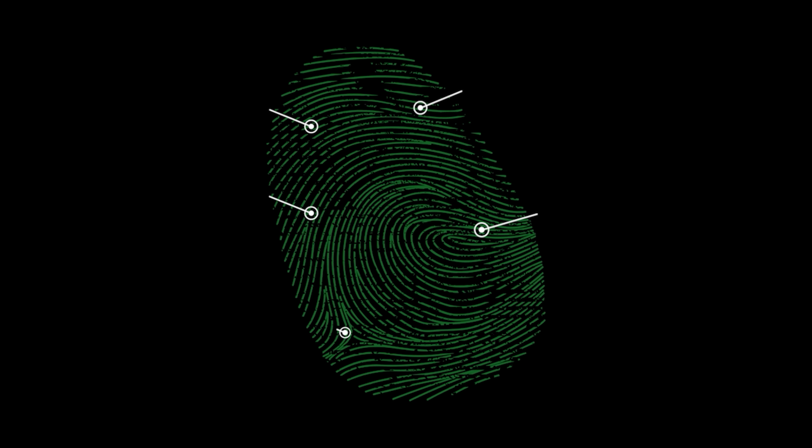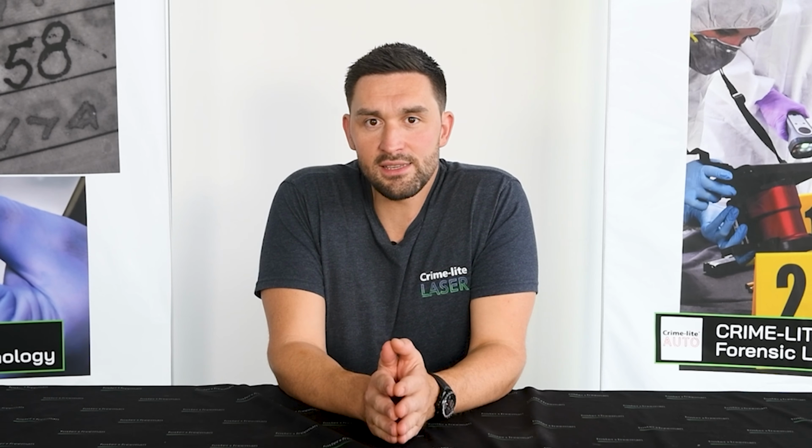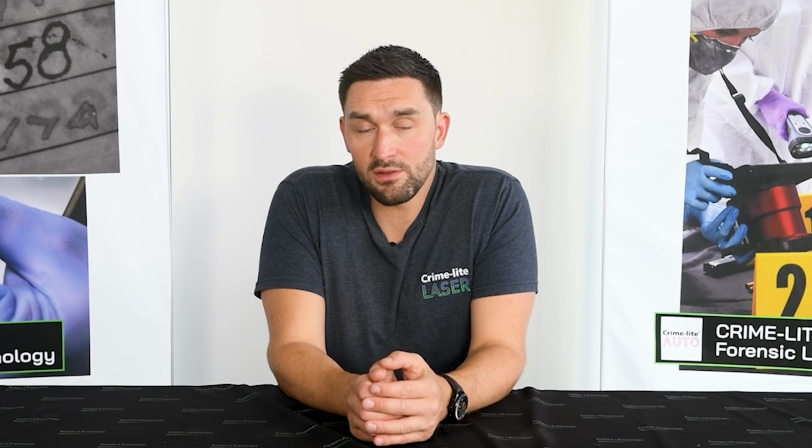In order to maximise the chances of revealing identifiable finger marks, forensic examiners must utilise a range of tools and techniques, including chemical processes, that are designed to interact with the components present in fingerprint residues. Reagents like ninhydrin and DFO bind specifically to the amino acids present in latent finger mark residues.